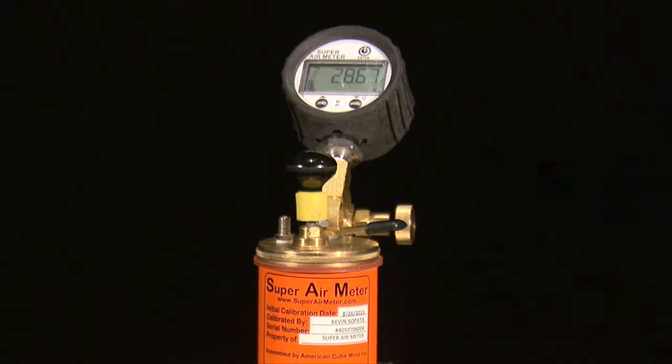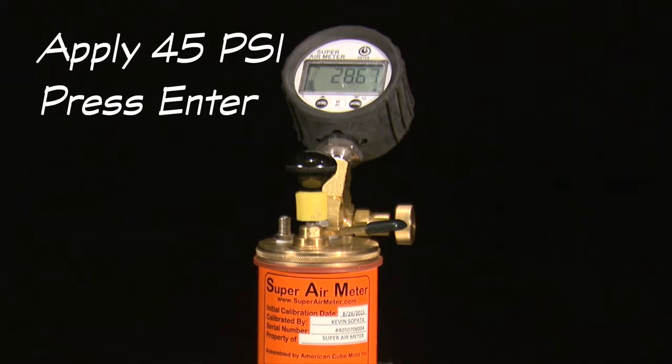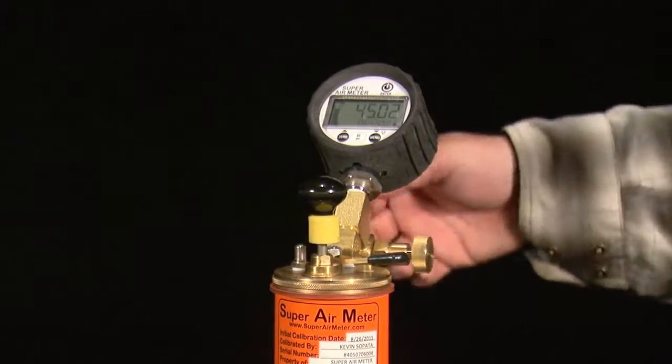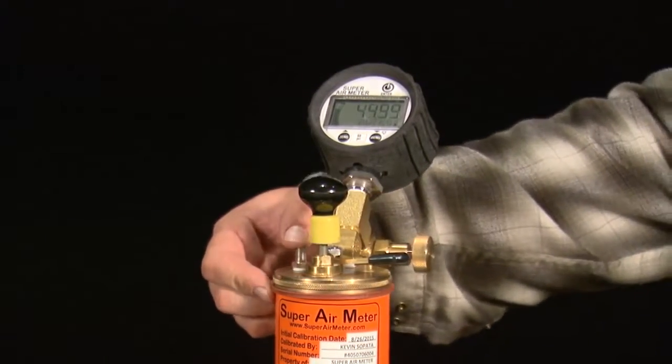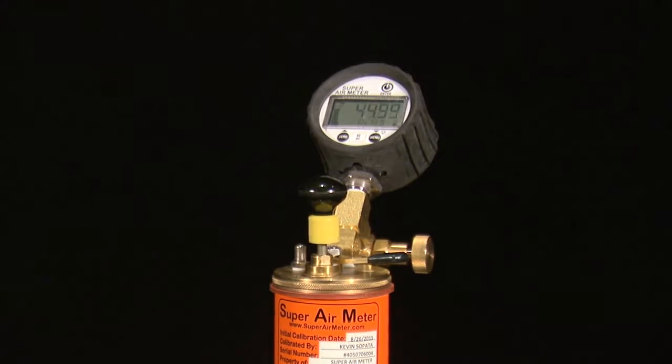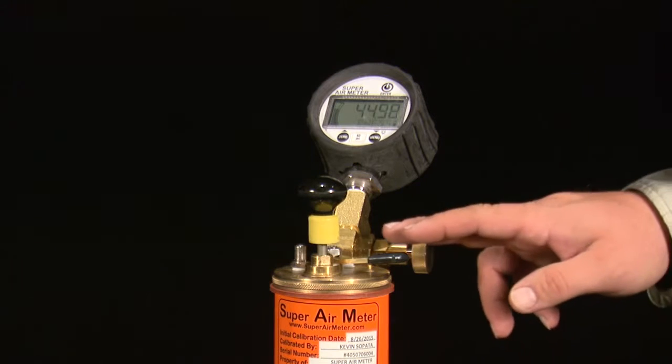The gauge will then display the next set of test directions: apply 45 PSI and press enter. Use the pump or cape to pressurize the top chamber to 45 PSI and press the enter button. The gauge will then check the meter is pressurized to the correct pressure and display okay, too low, or too high.